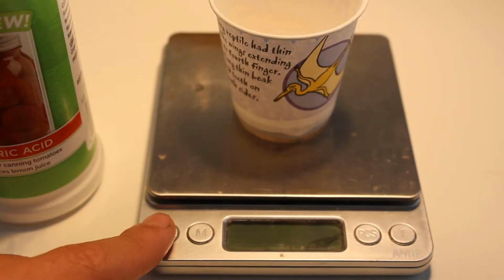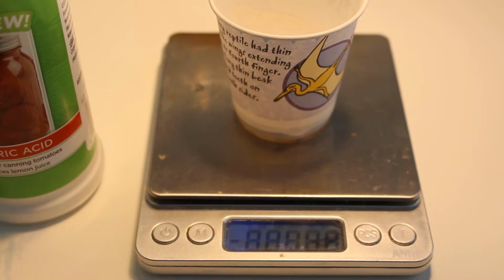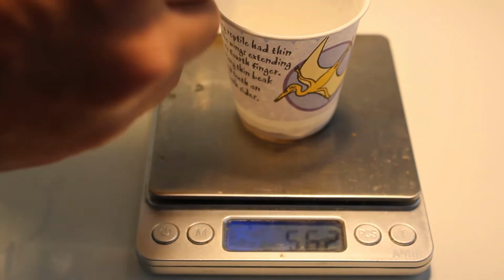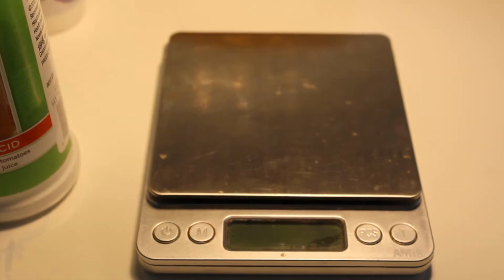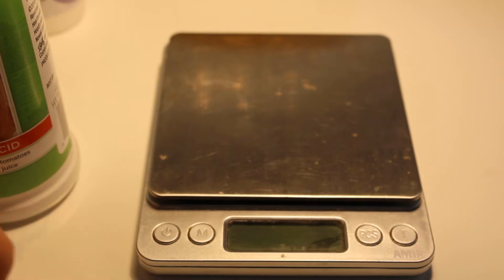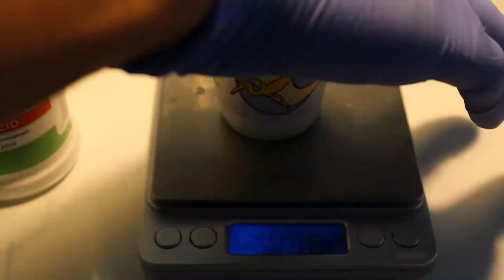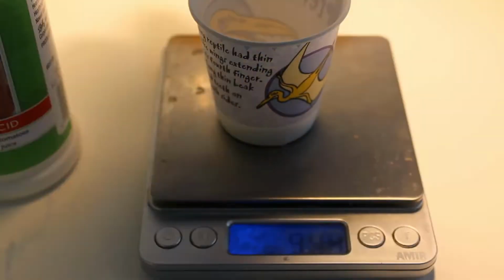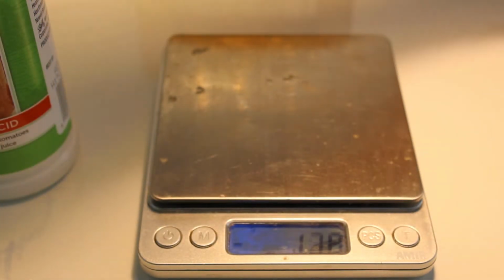Let's try this again. New measurement, 9.44 grams. There we go. Okay. Now I have a gas mask, so I have to yell or something. I'm not going to talk anymore. Okay, there we go. Exactly 9.44 grams. Let's put that off to the side.